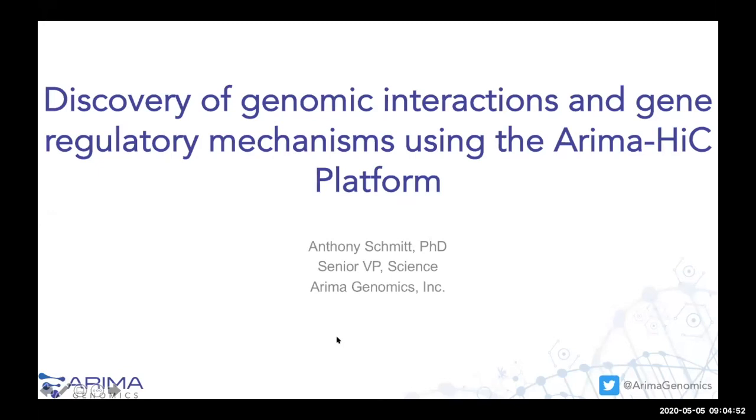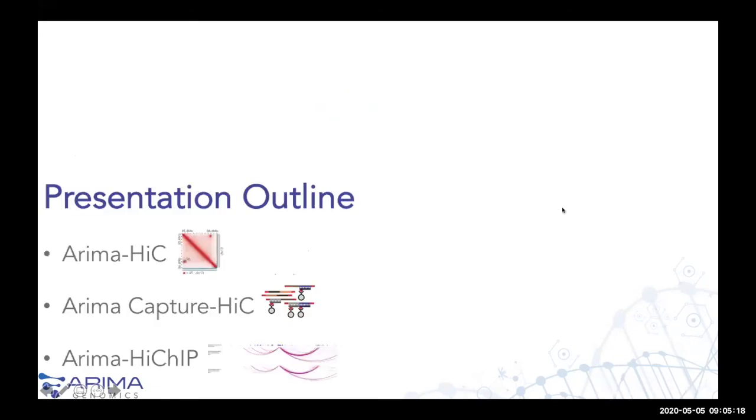Perfect, thanks. Well, I'm super excited to be here today. I'm even more excited, I think, to hear some of the published and unpublished work that we'll hear about over the course of the next couple hours. I think my function here is really just to introduce the underlying NGS-based approaches for 3D genome mapping and genome structure analysis, and I'll go over a few of those right now.